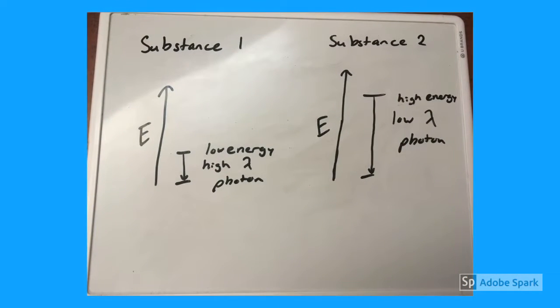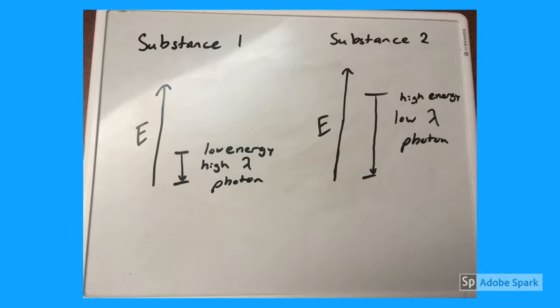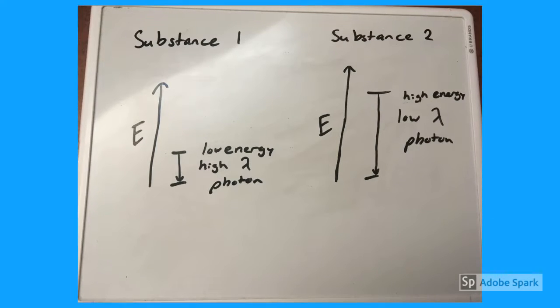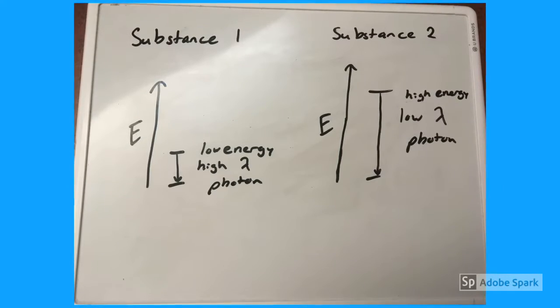The energy levels of electrons are different in differing molecules because the atomic composition of the molecules is different. These different energy levels determine the wavelengths of photons emitted by a substance. Whichever wavelength of photon emitted has the highest intensity is referred to as lambda max. An analogy to this would be box jumps.